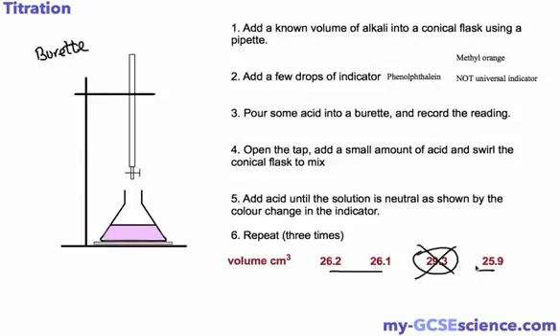Often for our titration we carry out at least 3 times. We can keep on going until we get exactly the same reading twice, but that ends up being quite long sometimes. But taking 3 readings, seeing if they're close, gives us a good indication that we have the right or accurate measurement. Okay, so this is the method by which you carry out your titration. If you're lucky, you'll get something like this in a 6-mark question, but certainly something you need to know.